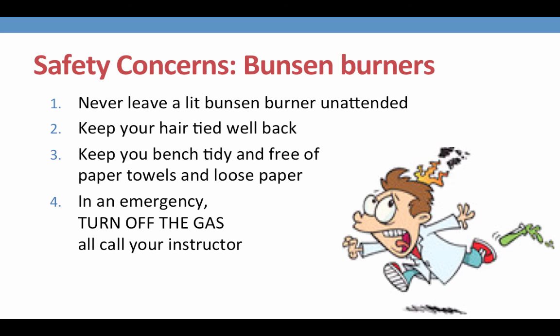If there is an emergency and things start catching on fire, first thing you should do is turn off your gas tap and then call over your instructor and they will help you and put out the fire and make sure that everyone remains safe.